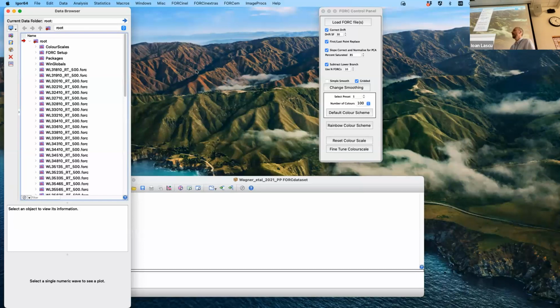So I guess I'm just curious about the significance of the difference of those end members versus breaking it down. Right, and it depends on whether two end members are along the horizontal, along PC1, or they go more along PC2, and PC1 is kind of going in between one end member and the mix of the others.